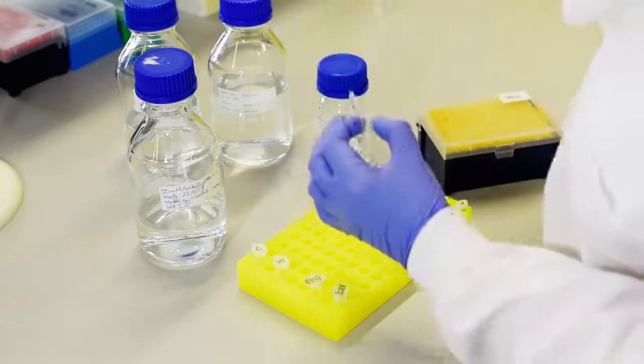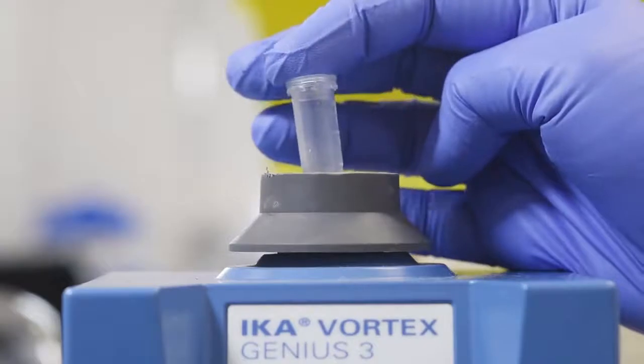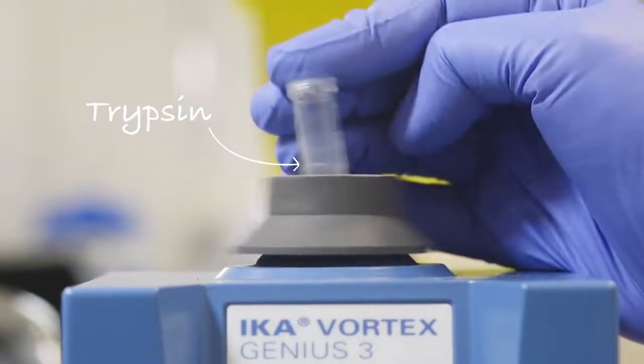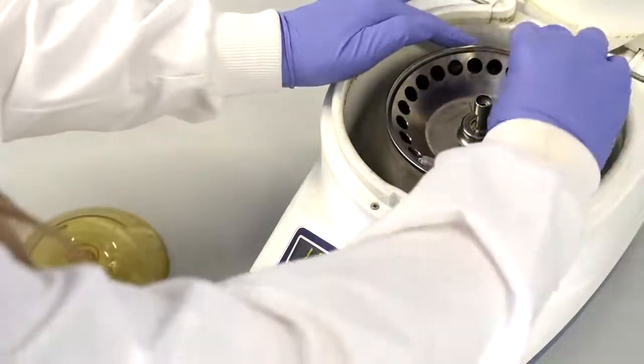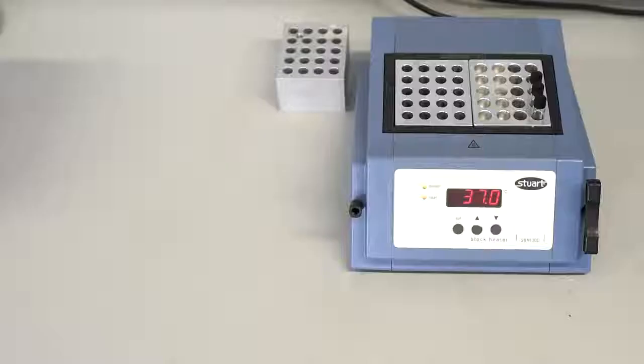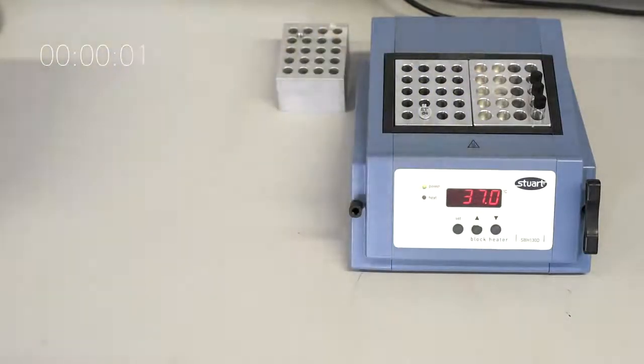The long curly collagen molecules need to be extracted from the eraser and cut into smaller fragments called peptides. This is done by adding a small amount of an enzyme, trypsin. The solution is mixed and incubated at 37 degrees Celsius for 4 hours, allowing the trypsin to digest the collagen strands into peptides.